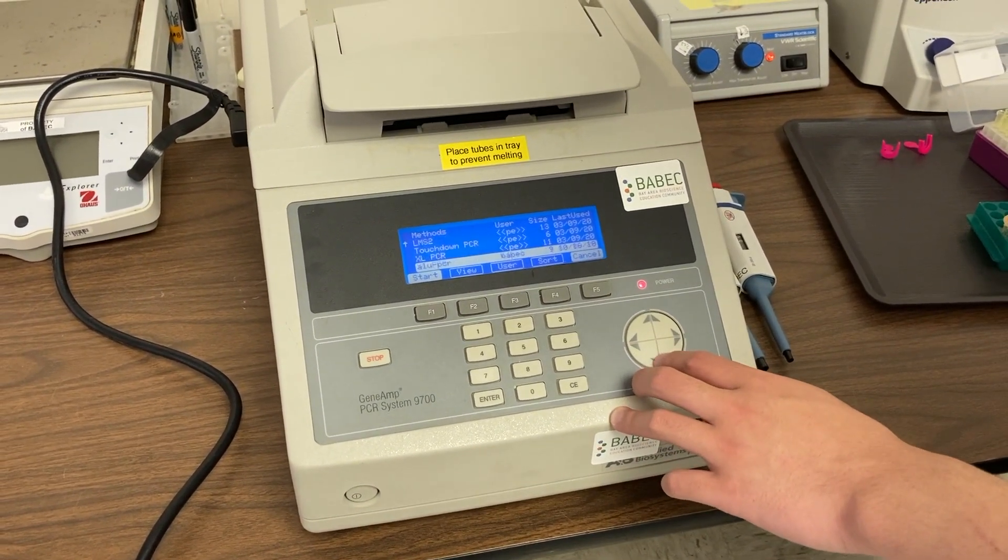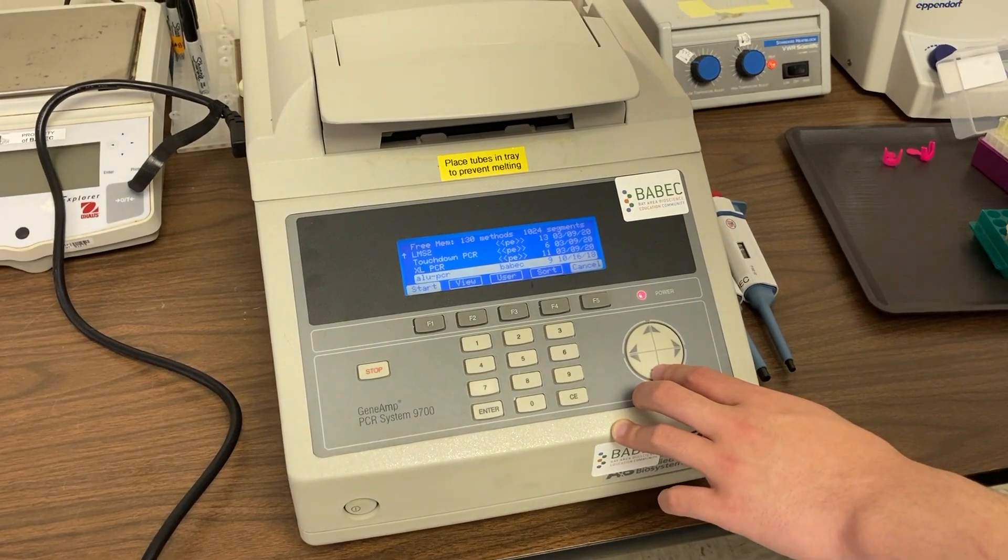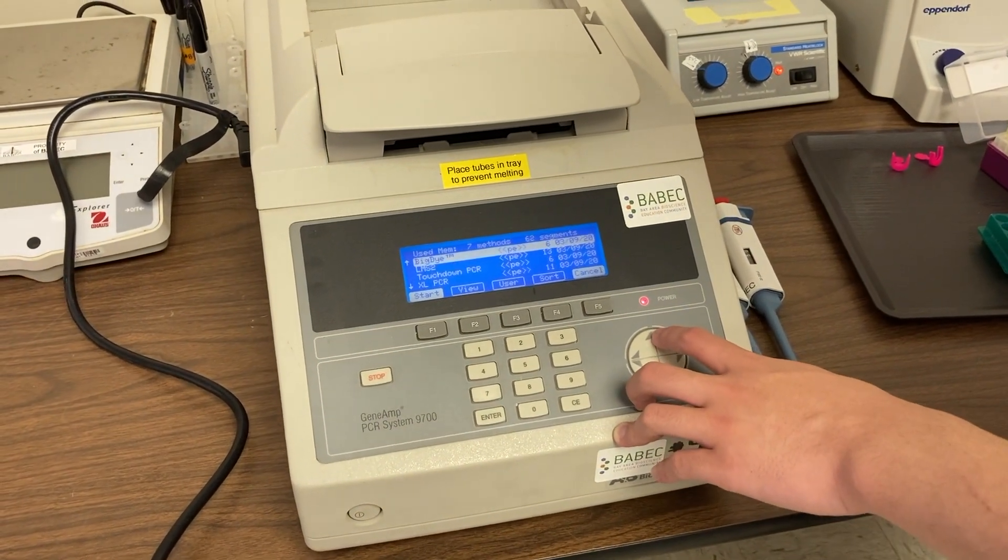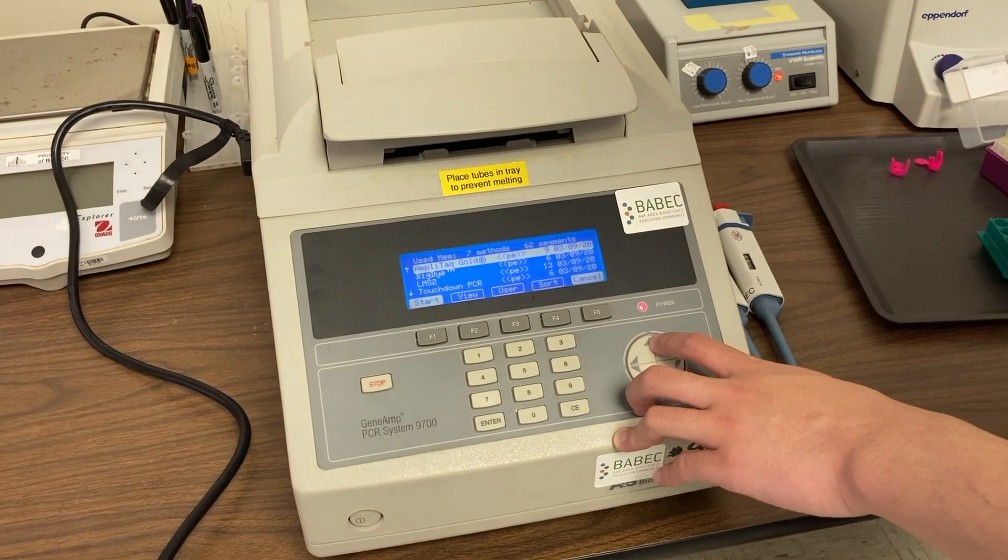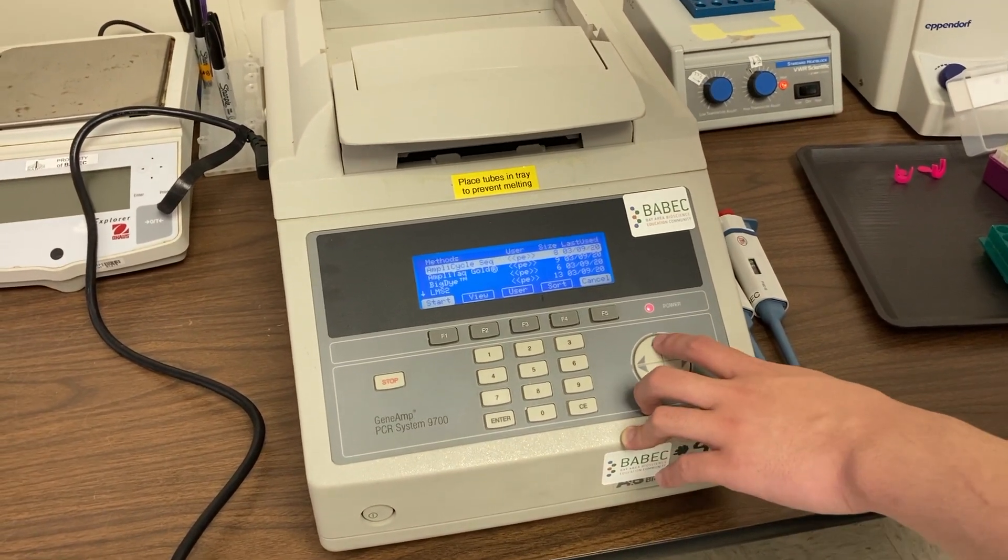Typically, we set the machine to do around 30 cycles of these specific increases and decreases. If everything works well, the TAC polymerase will make millions of copies of our target DNA.